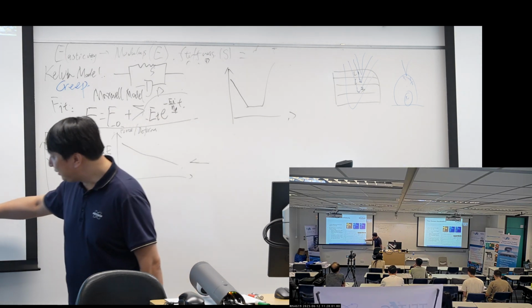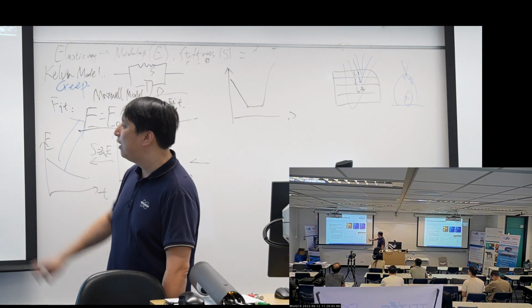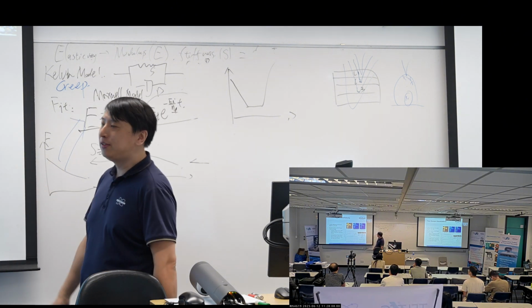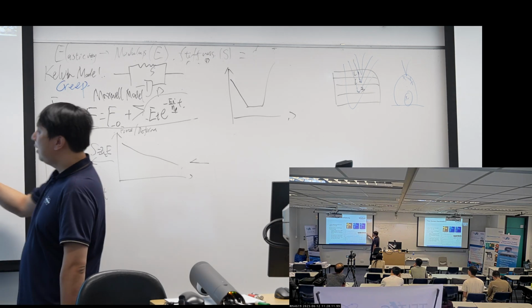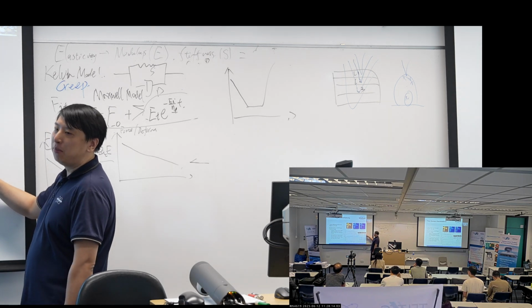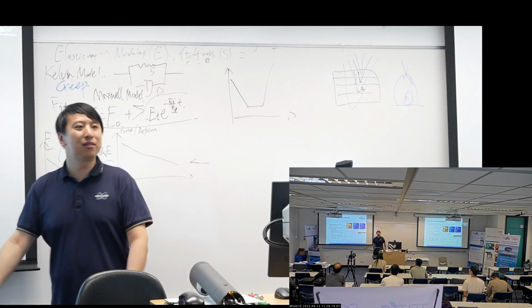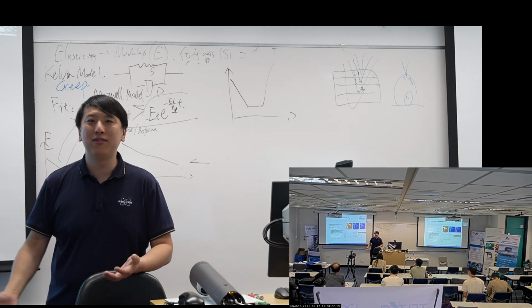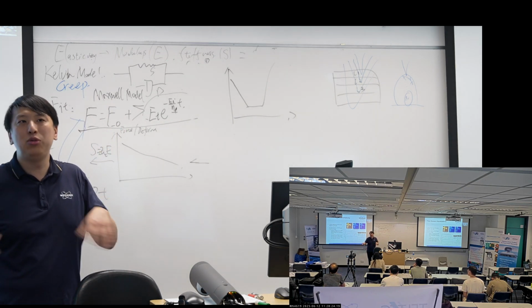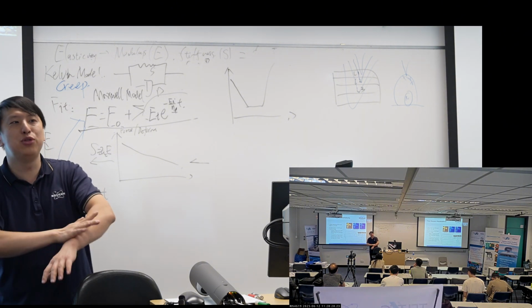So he took out the lifetime terms and said that for the live cells, it decayed more slowly than the fixed cells. That's just the same as our life experience. When you are alive, you are kind of soft. When you are dead, it's kind of hard to push.